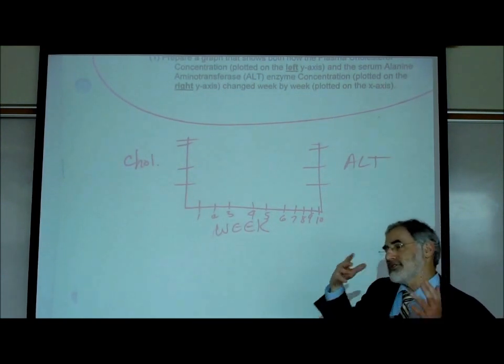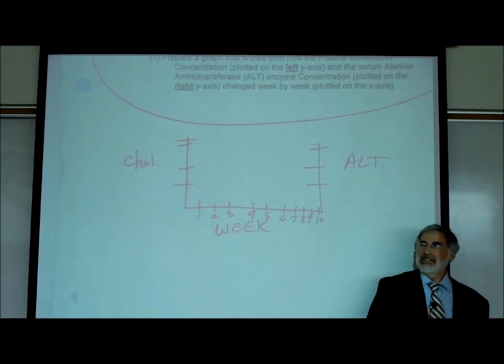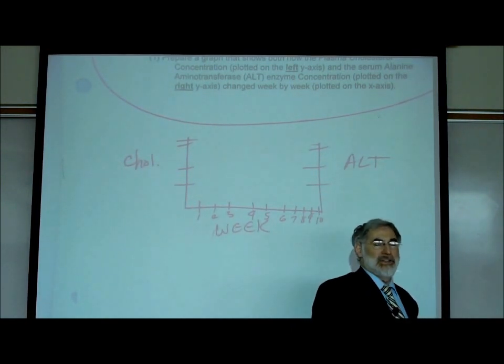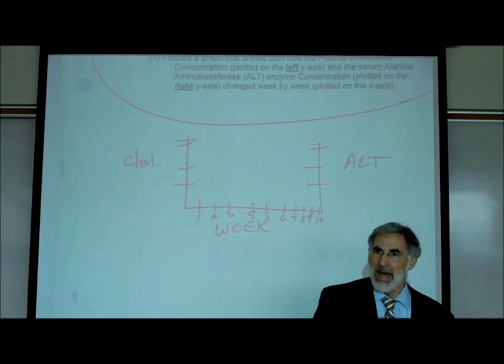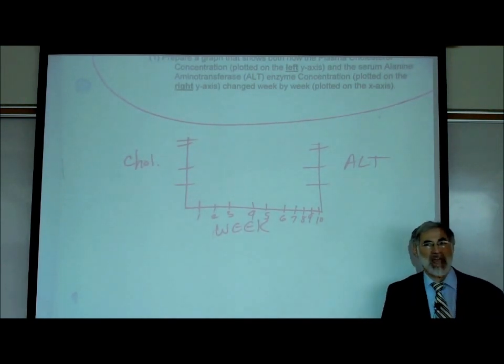Everything that I described is exactly what happens in real life in medicine. Now again, we're not saying that the doctor is doing these spectrophotometry. They're not sitting and putting the blood samples in a spectrophotometer, and they're not doing this graph. But they are getting the data back from the lab. And they may even ask to have it presented in a graphical form. So that's what the labs provide.